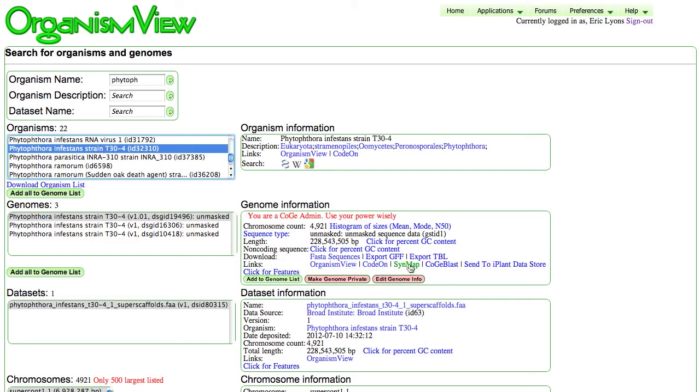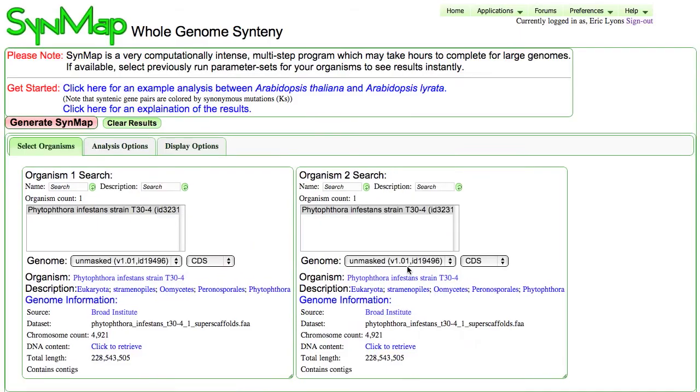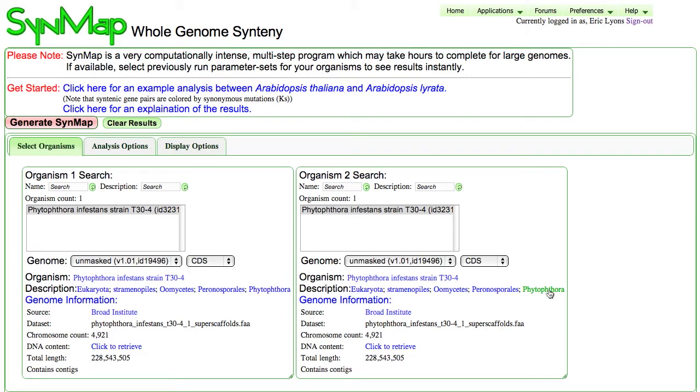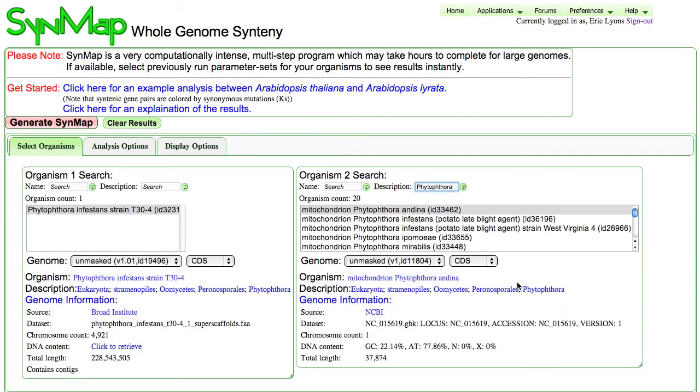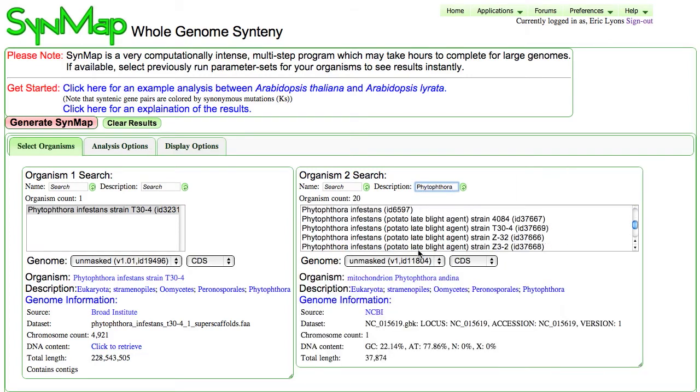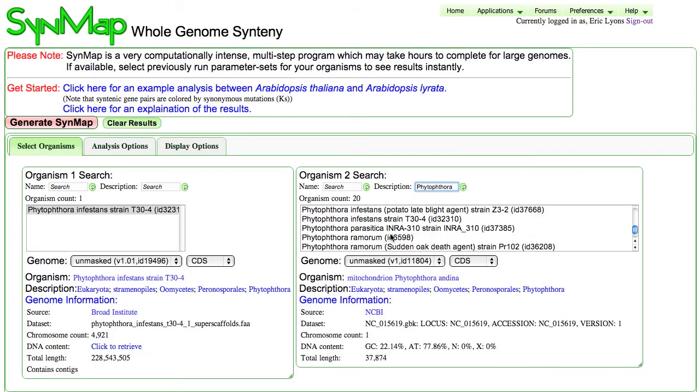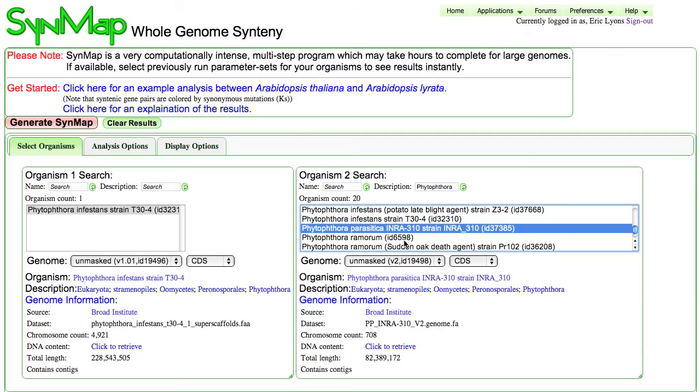...I'm going to compare it to another species using the program SynMap. So I'm just going to click on the link to SynMap, and when SynMap loads, it'll have this organism loaded in both the organism search boxes. What I want to do is find a different species for one of them, so I'm going to click on the organism description for the genera, and with it, I'm going to select the parasitica species, strain INR 310.